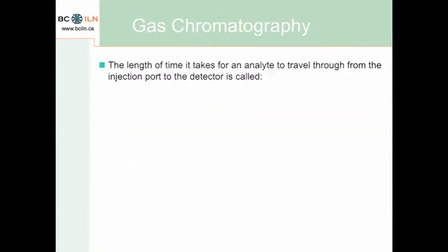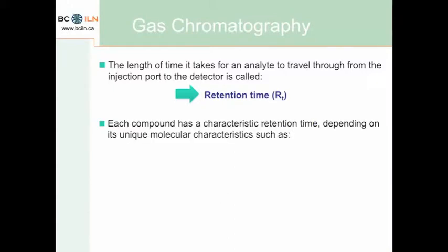The time that it takes for an analyte to travel through the column, from the injection port to the detector, is called the retention time, usually abbreviated as RT. Every compound has its own characteristic retention time that's dependent on its unique molecular characteristics, such as the boiling point, molecular weight, and polarity.